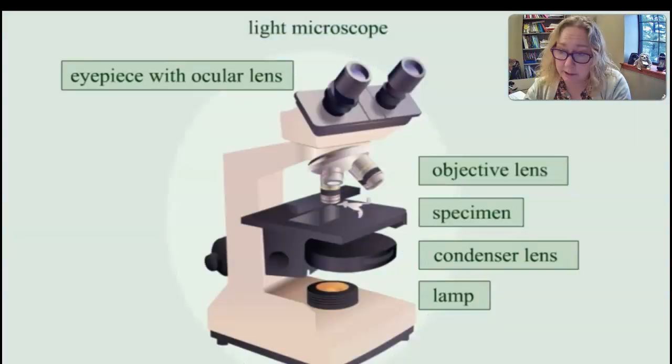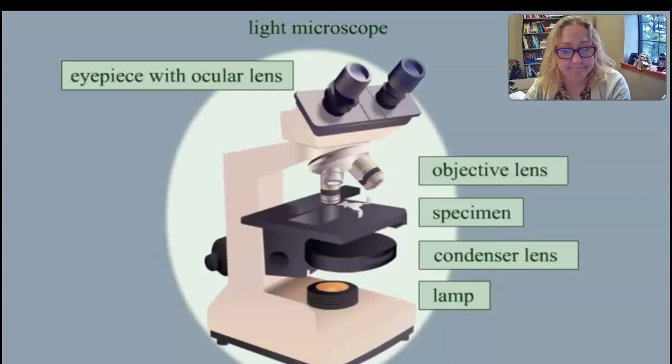Here is a delightful animation for you. Light microscopes are useful for studying specimens ranging in size from about 1 millimeter to about 200 nanometers. It's impossible to study anything smaller by light microscopy because the shortest wavelength of visible light is about 390 nanometers, and anything smaller will not interact with the light. The most common form of light microscopy is called bright field microscopy. In this form of light microscopy, the light beam passes through the sample and into the objective lens.